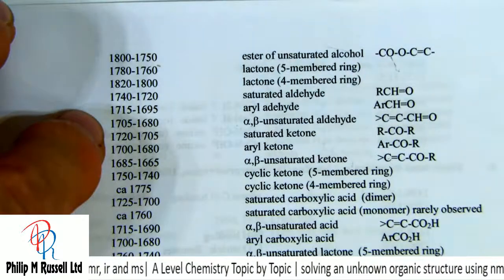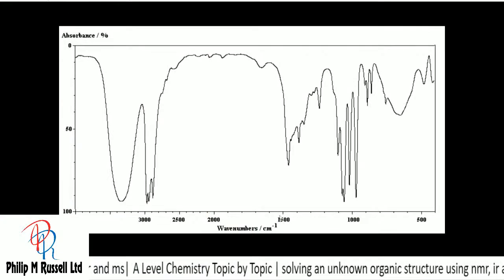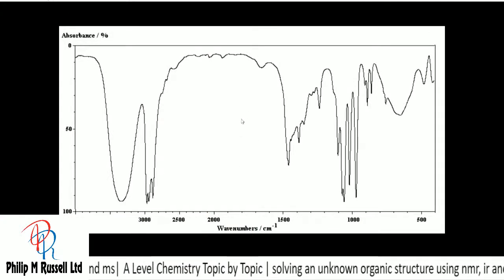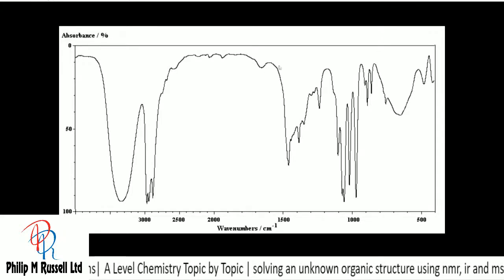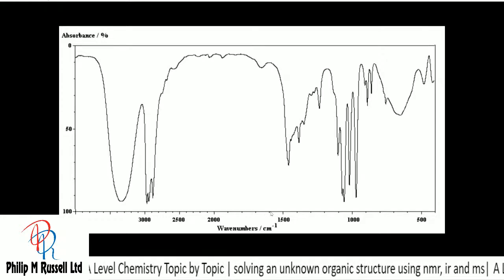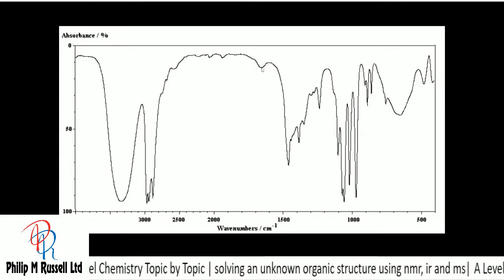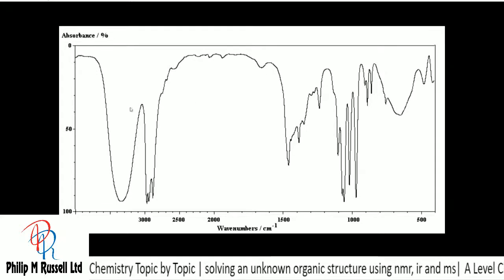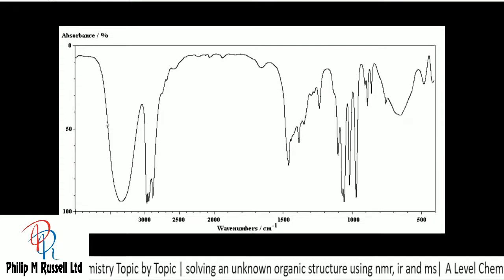If you look at the spectra, that will be around here. It'll be a peak here. There's absolutely nothing, so we can confirm there is no C=O. And secondly, the next one you also look for is the C=C, which is 1600. Possibly there is something there, but not fabulous peaks, which you pay more attention to.